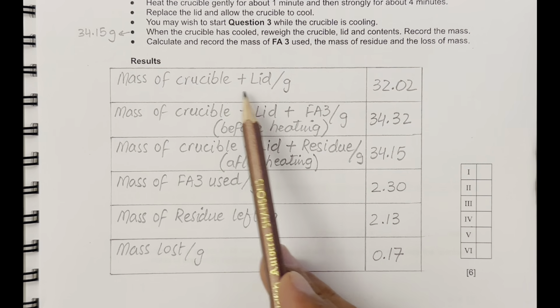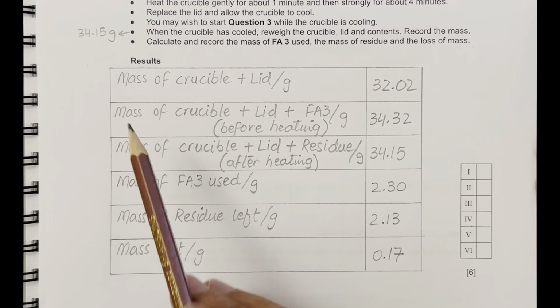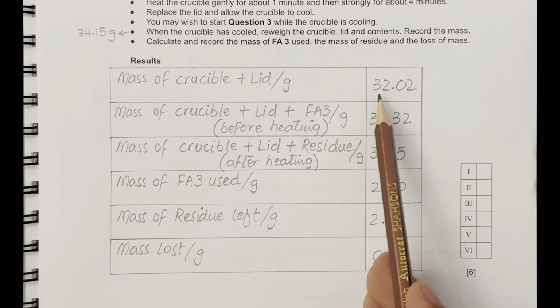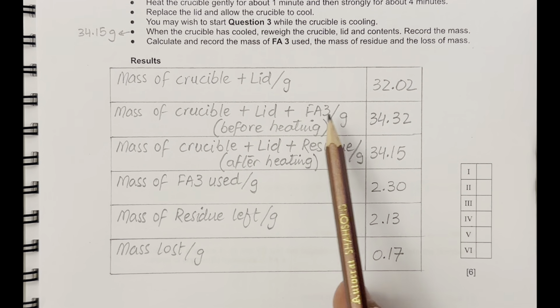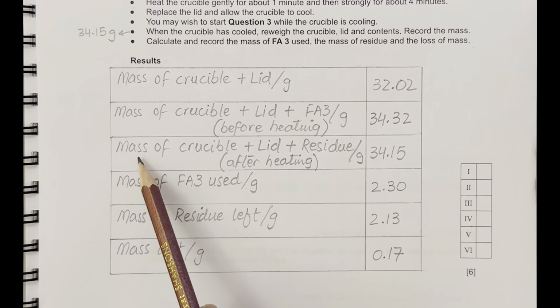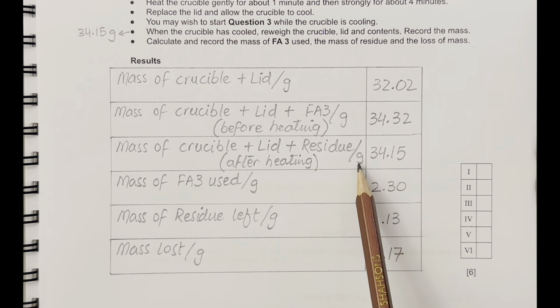So all the observations of masses are recorded in the form of a proper table. While drawing this table, remember to write the masses in this way: mass of crucible plus lid in grams, then mass of crucible and lid plus FA3 before heating in grams, then mass of crucible plus lid plus residue which is left after heating in grams.